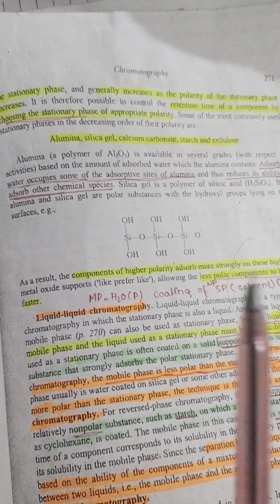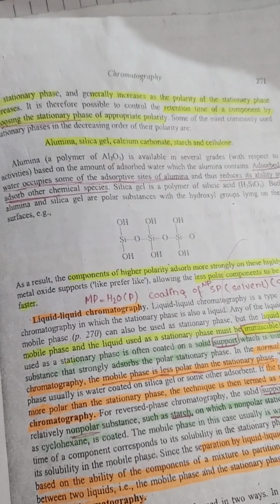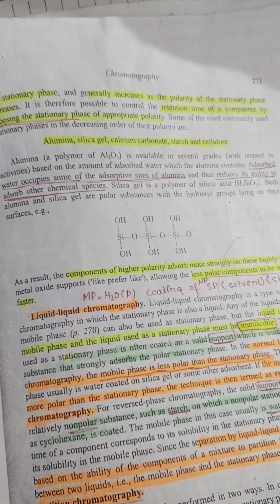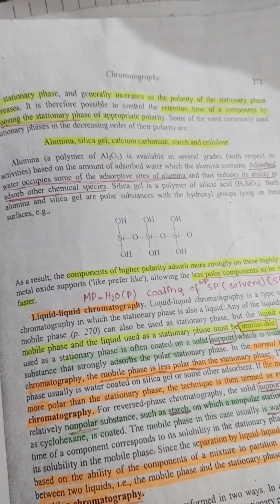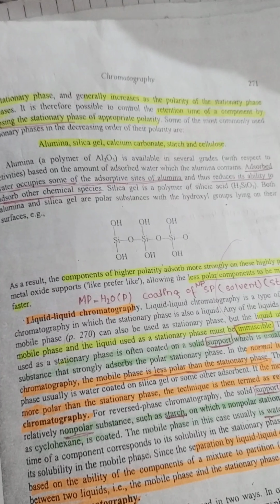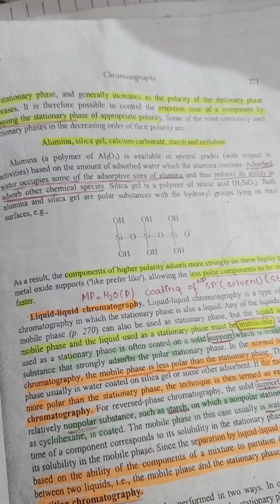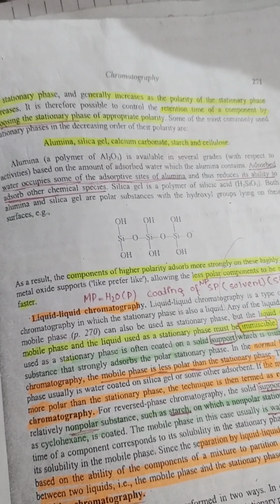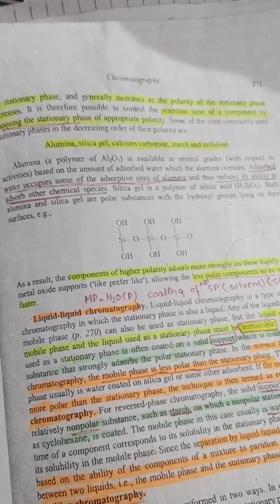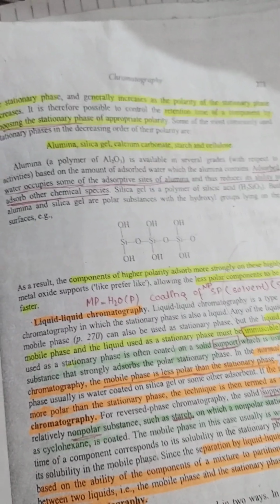Now, the stationary phases in decreasing order of polarity are: alumina, silica gel, calcium carbonate, starch, and cellulose. We discuss the two polar stationary phases we use mostly: first alumina and the other silica. We use alumina in several grades. What is the meaning of grades? We treat alumina with water, and the water occupies the space present in the alumina, so there is less space available for the adsorption of components.